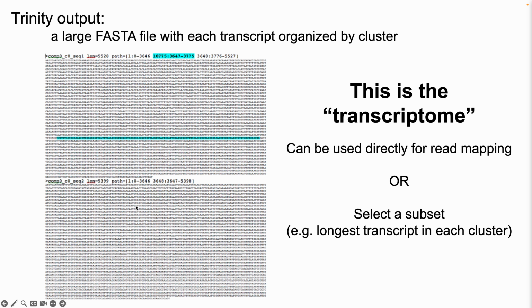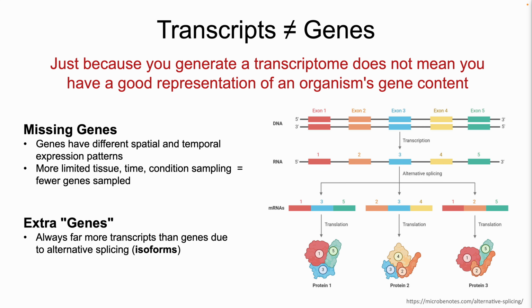These are transcripts. That's the best assembly that you can do from all your 150 base pair Illumina reads. You assemble those. That's the reality. Some of those transcripts were 1, 3, 5 transcripts, but that's not the gene in the way that you typically think of a gene, because the gene is all 5 of those exons.